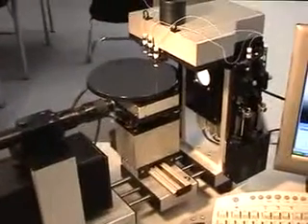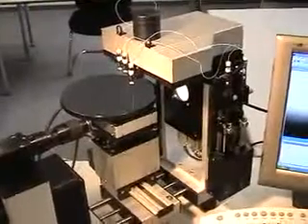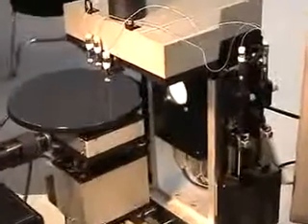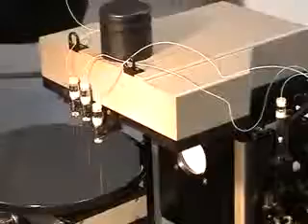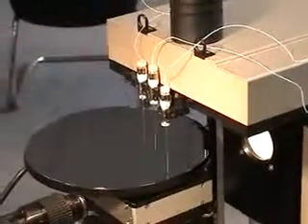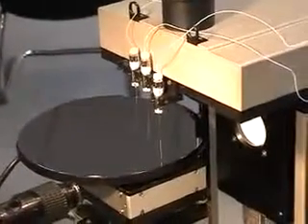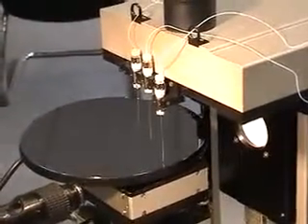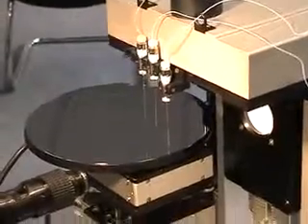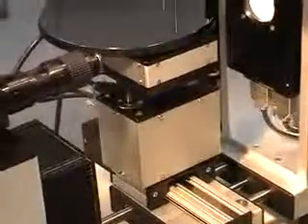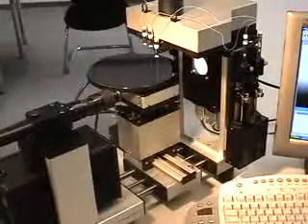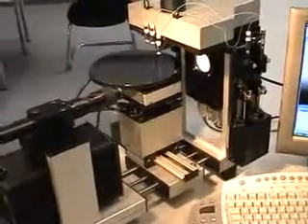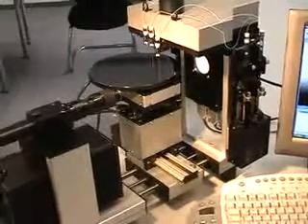We show on the right hand side the backlighting illumination and the multiple dosing system for up to four dosing needles. There's a sample table for X and Y axis to position the wafer accordingly.